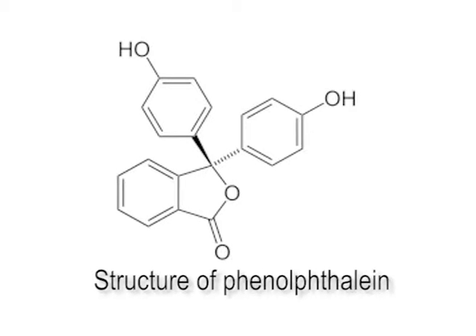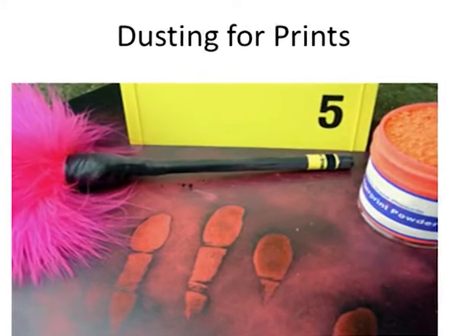Then potassium hydroxide around 20 grams is taken and powder zinc, that is 20 grams, is placed in distilled water around 100 ml. The contents are refluxed for 2 to 3 hours until the formulation becomes colorless. This solution is kept in a dark colored bottle and care is taken that it remains in contact with zinc powder.